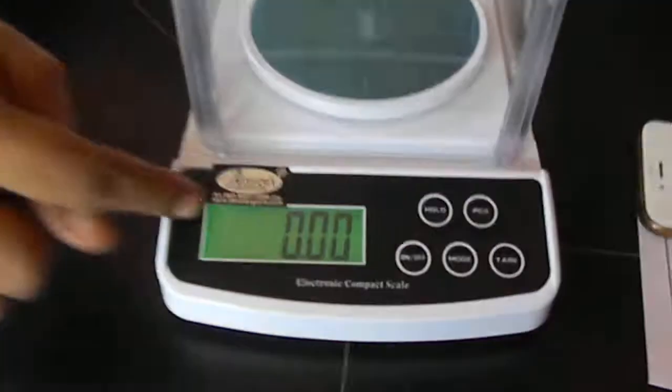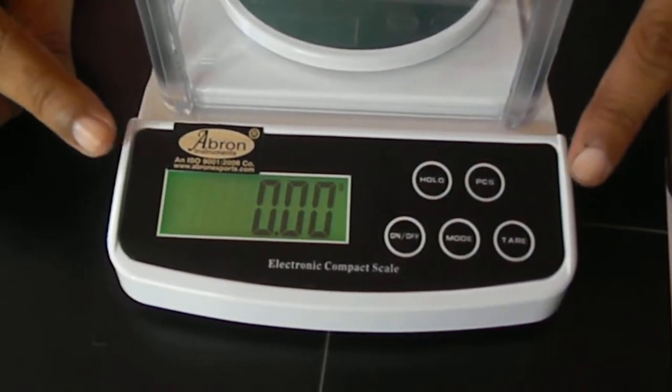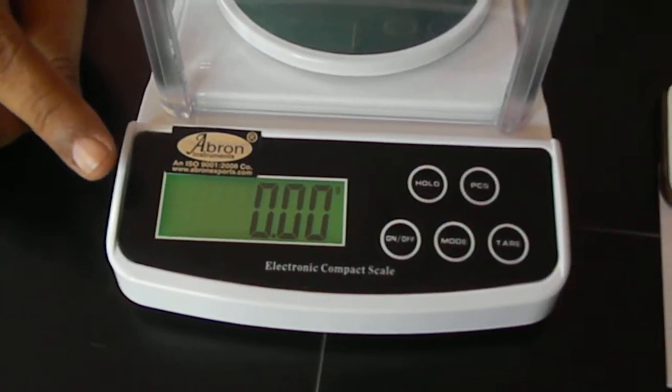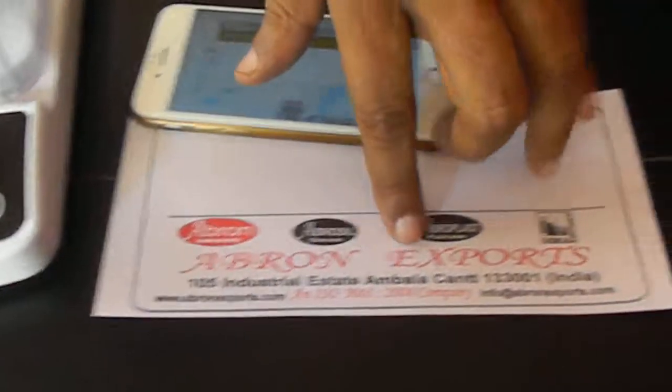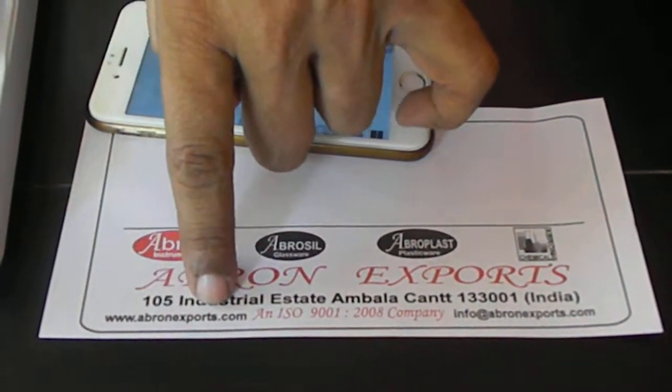And this has different modes. Please visit the website. It has a capacity of 500g. This model, this particular model. Please visit Abronexports or the website www.abronexports.com.